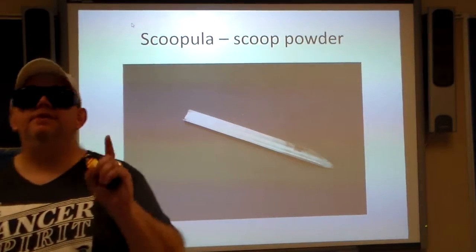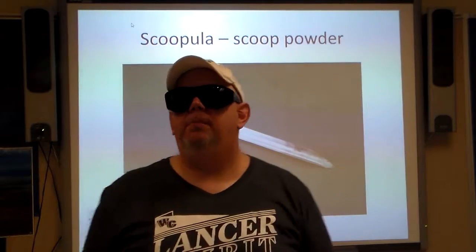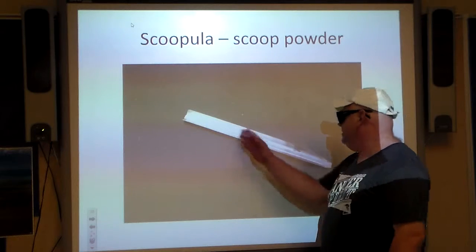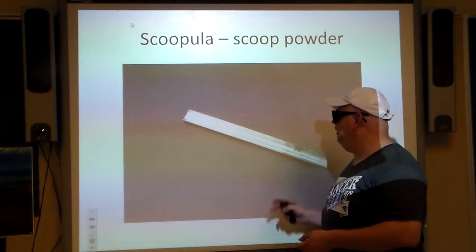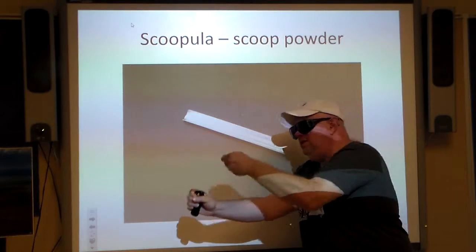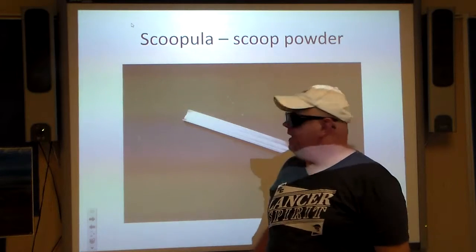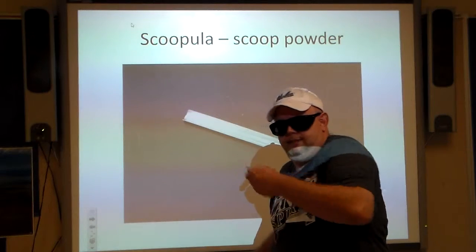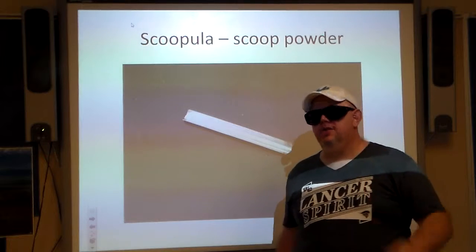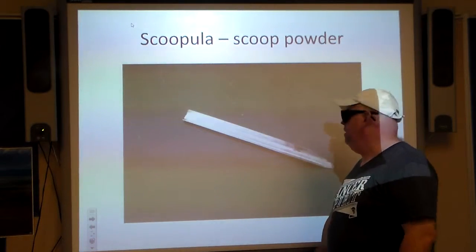Scoopula — not to be confused with Count Chocula. It's literally called a scoopula. It is a piece of metal — you might think it looks like a tent peg you pound into the ground when camping. But that's not what it's used for. It's for scooping — scooping out powder or whatever you need.